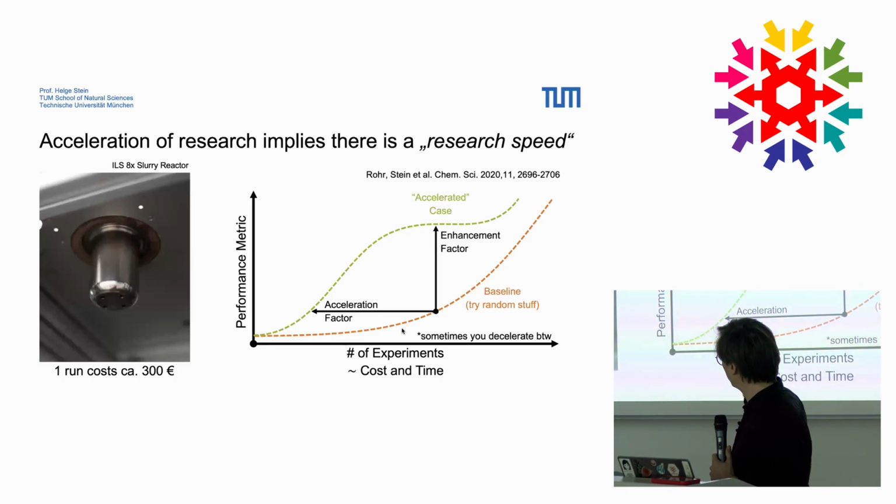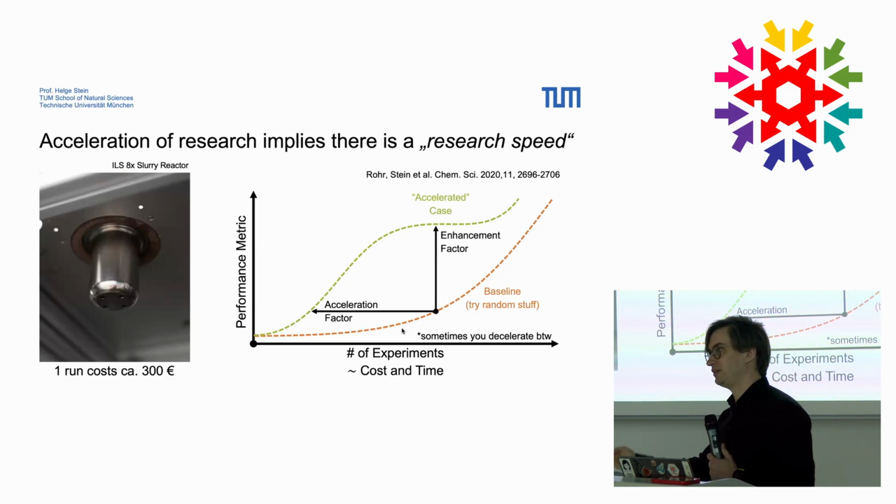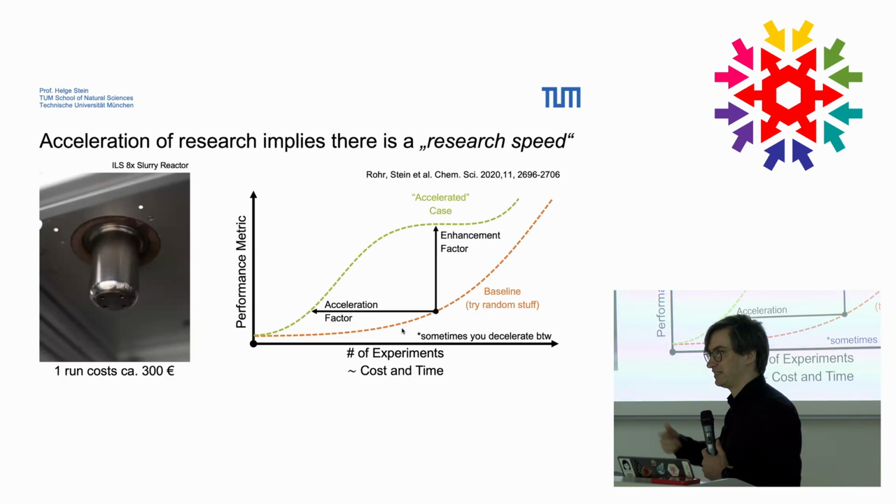So what we then defined is an acceleration factor, where the acceleration in our case is: what factor of fewer experiments do you need to get to the same performance metric? Because sometimes your performance metric is just better. So how to measure better? Sometimes hard. What we did in a couple of benchmarking cases is we already mapped the entire response surface, and we just count whenever we find something from the top percentile, and with what probability I get a sample from the top percentile. This is simple because the probability by just guessing is 1%.